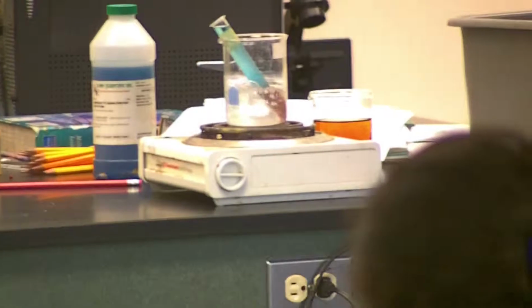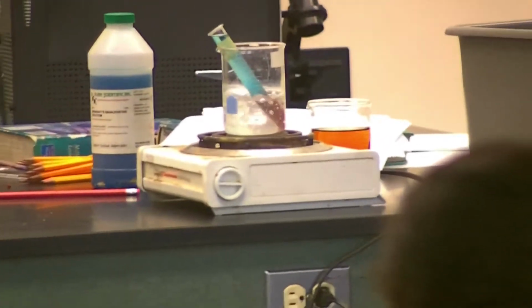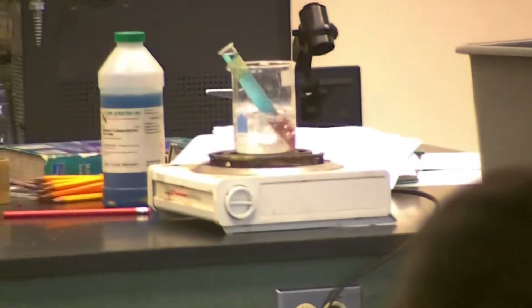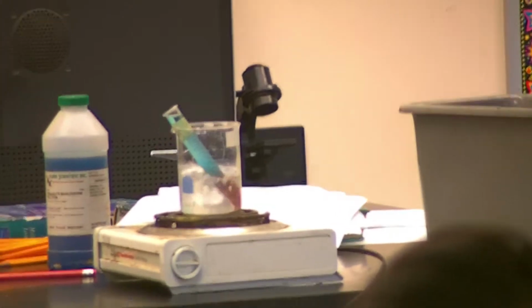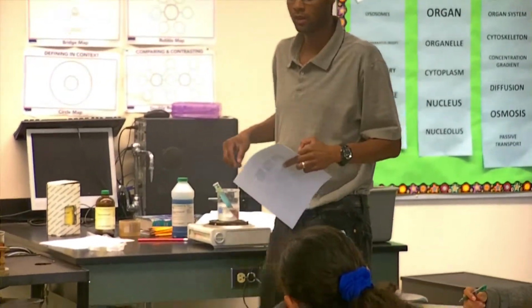All right, starch. Did starch leave? How do we know that? Because the iodine stayed the same. It will turn black had there been a difference. The glucose, how do we know? We know because it started to turn carrot orange. It just takes a little bit longer. And water, did it diffuse? Stay the same.